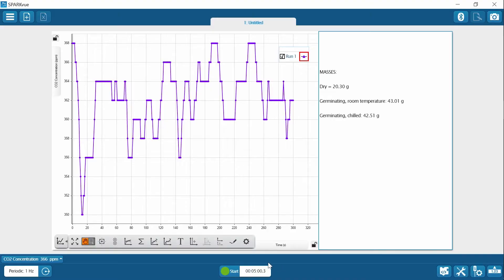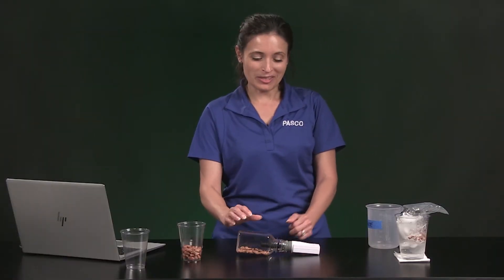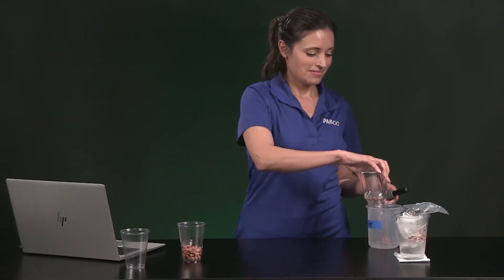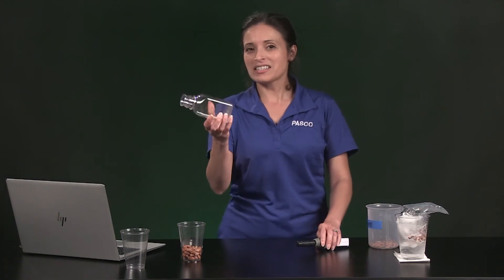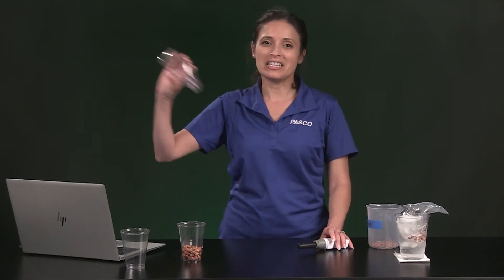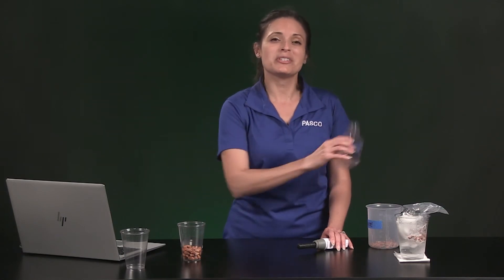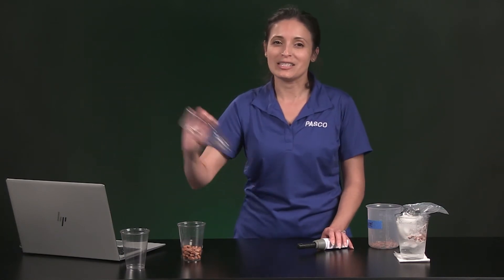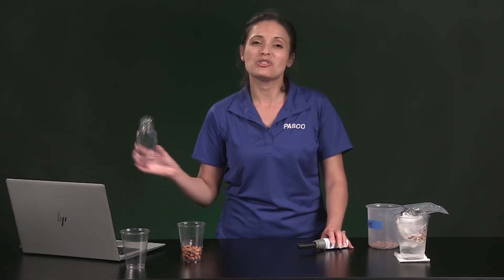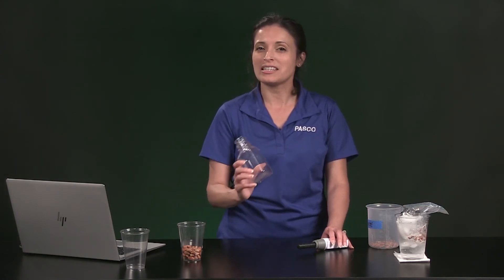Also record the time elapsed for the trial, which you can find here. Remove the seeds from the sampling bottle. One way to remove excess carbon dioxide from the bottle is to wave it in the air a few times like this. For the next run, we will repeat the procedure with room temperature germinating seeds, but first make a prediction of how germinating room temperature seeds will affect the amount of carbon dioxide in the bottle. Pause the video here and resume playback when you're ready.